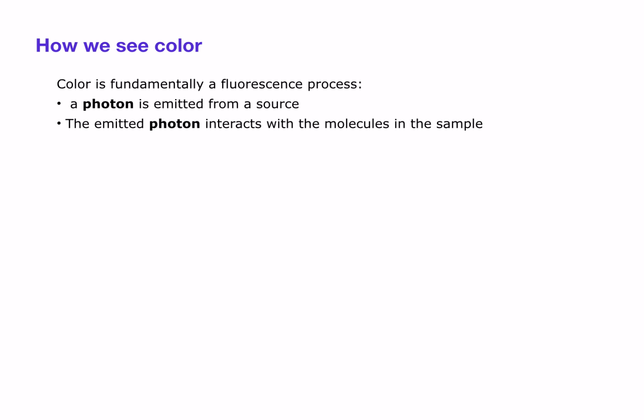Now the photon, after leaving whichever source it comes from, interacts with molecules in a sample. Now, let's focus on a molecule. That means there's more than one atom and almost certainly more than one element. In this case, the photon is interacting with the outer electron structure of these objects.